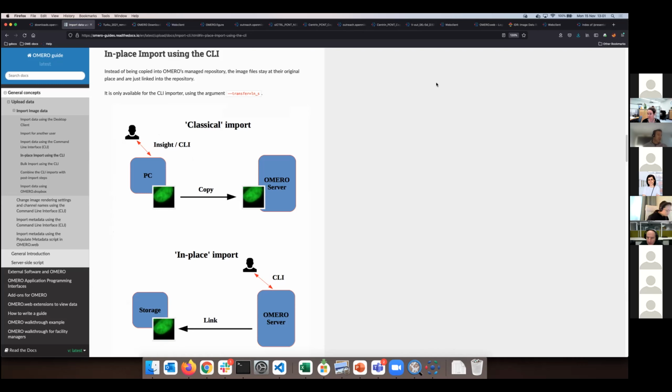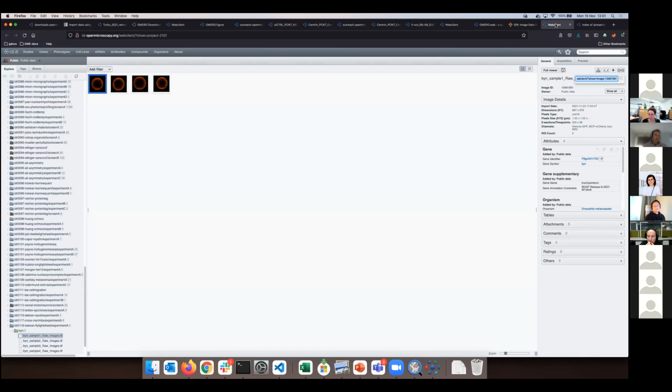So yes, this actually relates to what you just said about the image sizes, and I was just thinking about tissue stainings and this kind of multiplexing. If you would have several parallel stainings of big tissue pieces, how would that work? Because they are quite big. Yeah, I think that's where the desktop client is not very good, in the context of IDR that Peter indicated. We have the Human Protein Atlas. We've got all the data.